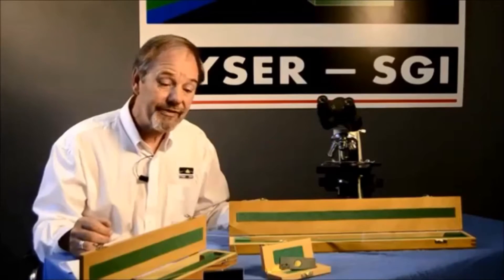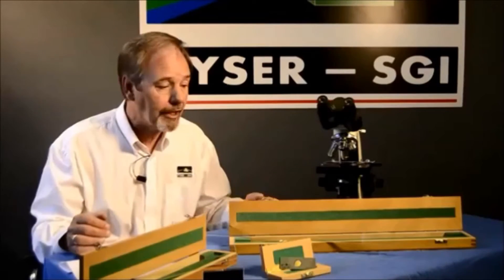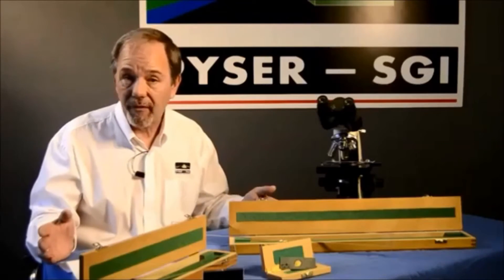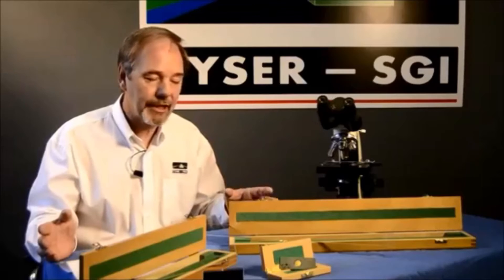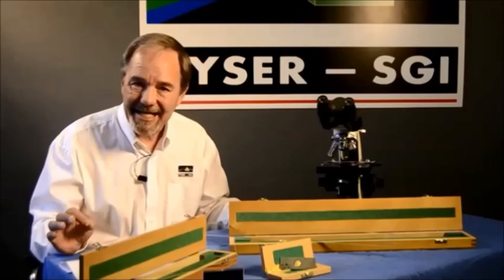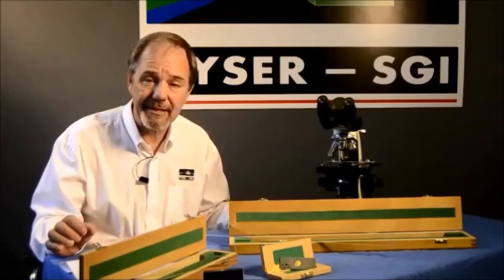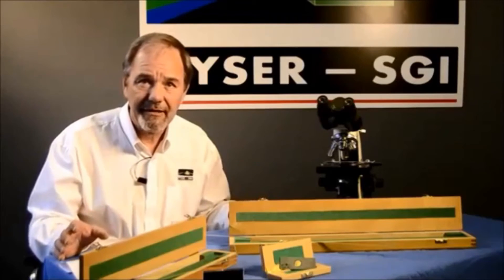There are many models of stage micrometer with different scale lengths and patterns to choose from — in fact there is a huge range of calibration equipment available, from long glass scales up to a meter long in some instances to glasses with chrome images just a few microns in size. Whether standard products available off the shelf or something manufactured especially to meet your particular measurement requirement, they all have one purpose in common: to confirm the confidence of your measurement method or system. The scales and lines must be manufactured to a very high standard with great precision and accuracy and fine high-definition lines, and if a scale is to be magnified greatly these lines can be as little as one micron in width.